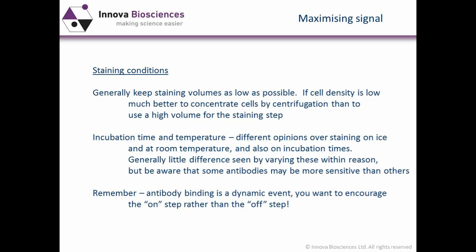Also consider the incubation time and temperature. You will find many different opinions over staining on ice or at room temperature, and also on how long you should stain with your particular antibody. I think in many cases people recognize that with most antibodies the difference between a 15-minute and a 30-minute incubation is quite small, and there is probably little difference between staining on ice and at room temperature.